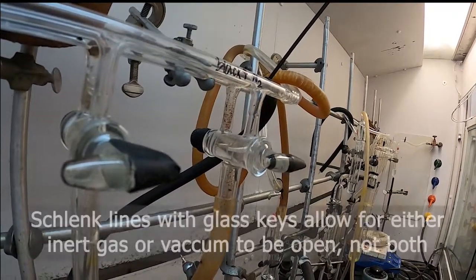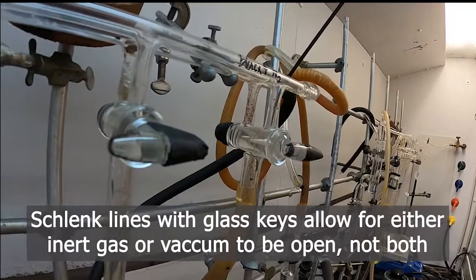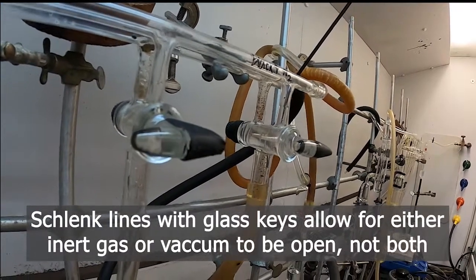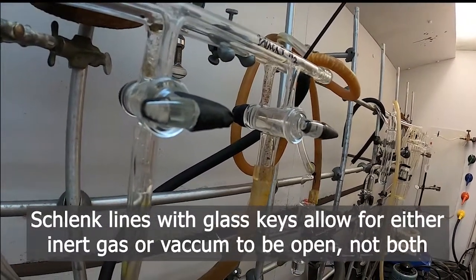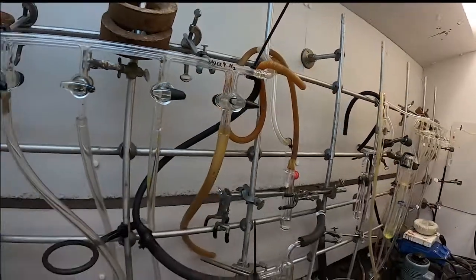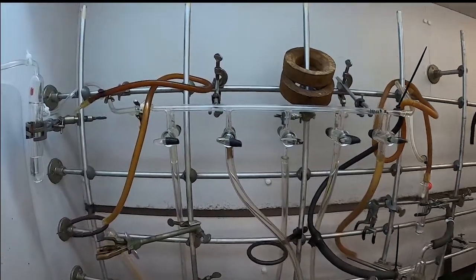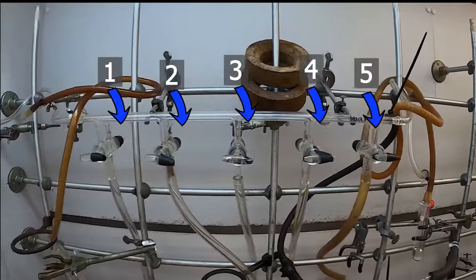And you can see here how this style prevents vacuum and gas from being connected to your line at the same time. And this one also has more ports. This one has five ports.